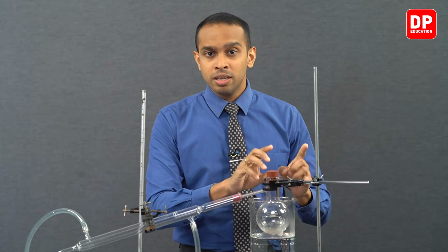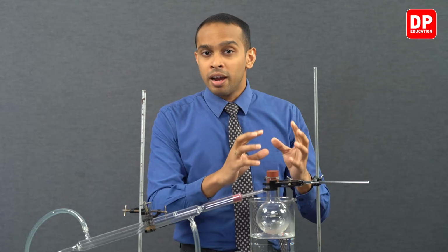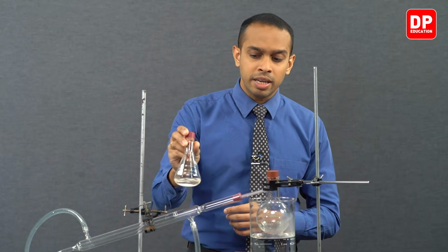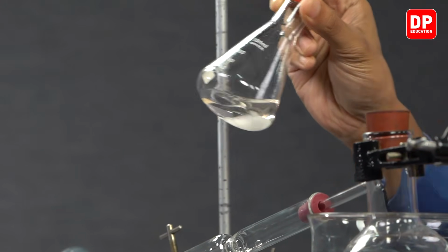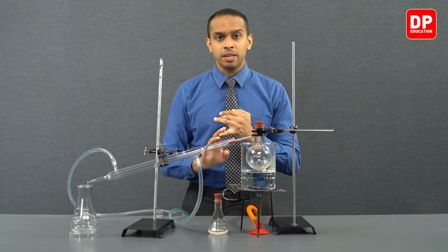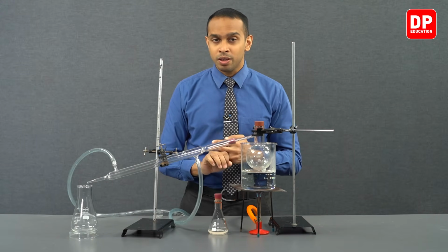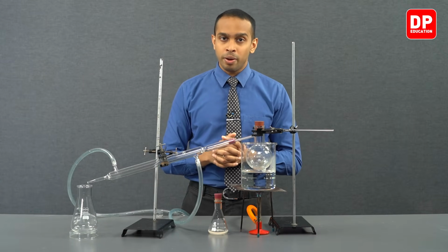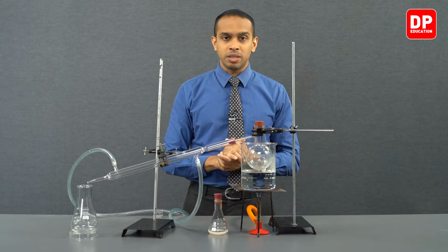So the essential oil that was originally present in the leaves of cinnamon is now extracted into this diethyl ether layer we have in front of us. So still, this is 2 main things. We have diethyl ether in this Erlenmeyer flask mixed with our essential oil. They are very miscible with one another because they are dissolving in one another very well. So how are we going to separate these 2 out? We can use simple distillation.